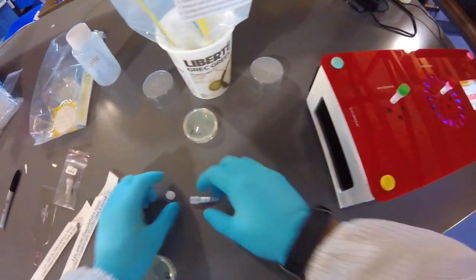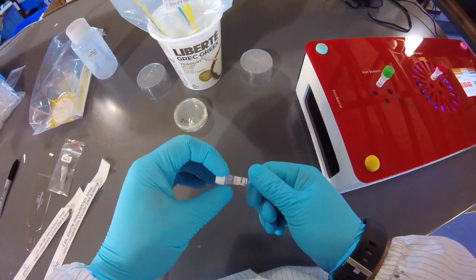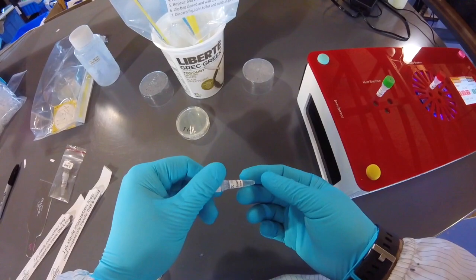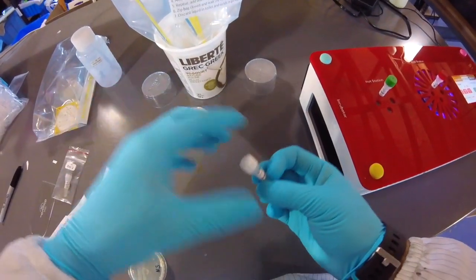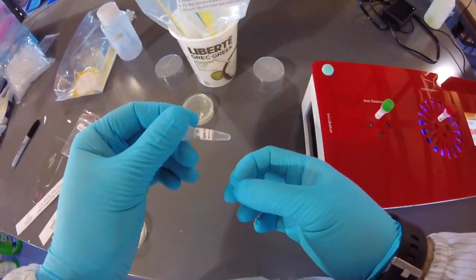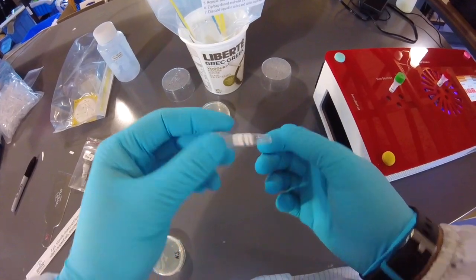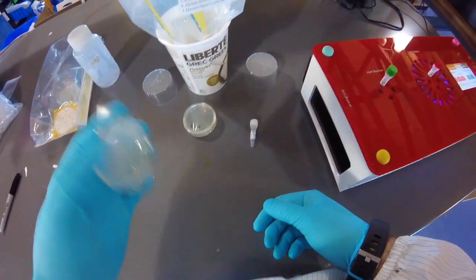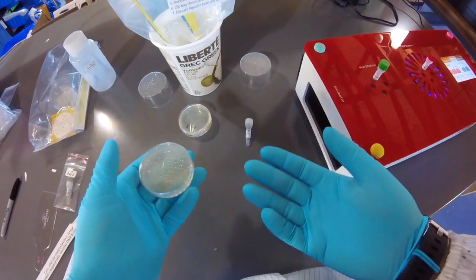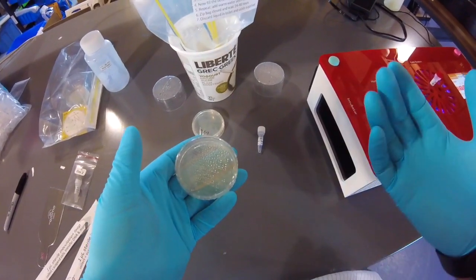So I'm just going to clean up my space here. You can hang on to the DNA. You can put it into a fridge. After you've used it, it should last like 6 months if you leave it in a fridge, but you have opened it to the air, and so things could have gotten in there which might cause it to break down a little bit more, but it should stay stable, and so you can collect these and get more and more colors. The cells we are done with. That was all. We only needed a few colonies of these bacteria in order to do this experiment.